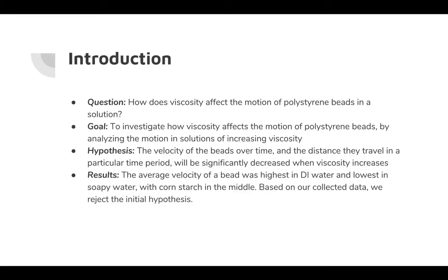So in this experiment, our question was, how does viscosity affect the motion of polystyrene beads in a solution? Our goal was to investigate the motion by analyzing the motion in solutions of increasing viscosity. Our hypothesis was that the velocity of the beads over time and the distance that they travel in any particular time period will be significantly decreased when viscosity increases.